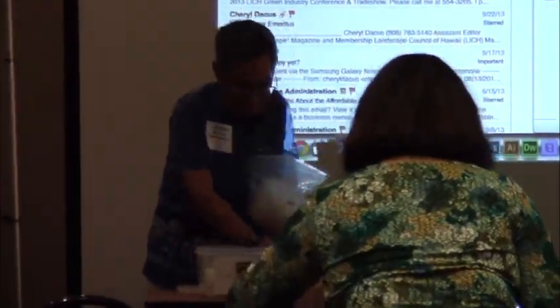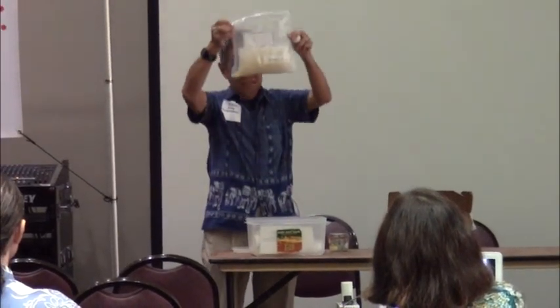And the key to this system is the indicator silica gel. You see there's one is yellow, one is green. It's actually exactly the same. The difference between the yellow and the green is simply that the green is hydrated, yellow is dry. The way this system works is this is desiccant silica gel, goes in the bottom of this pack. You sprinkle the yellow silica gel on top, and that tells you that the silica gel in here is dry and it can be used for drying.